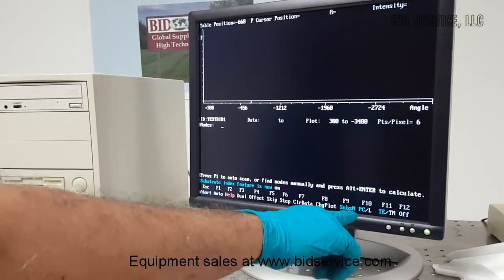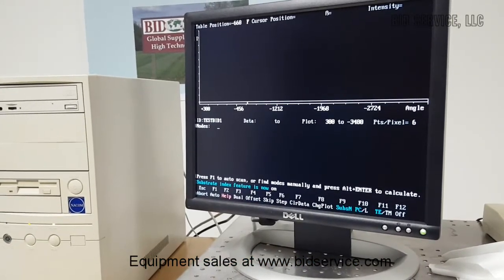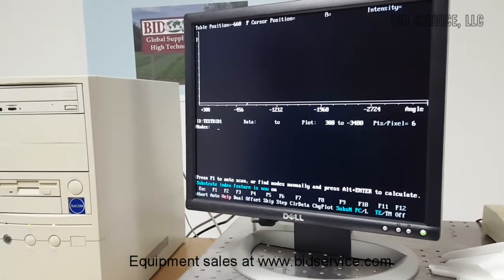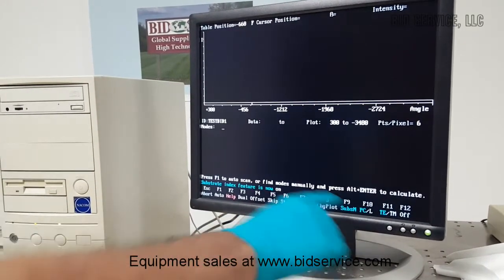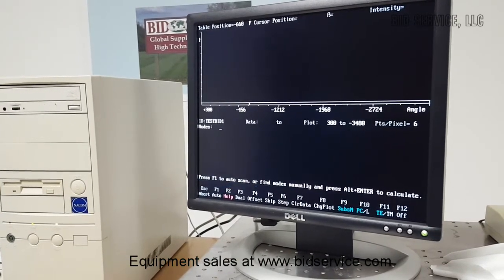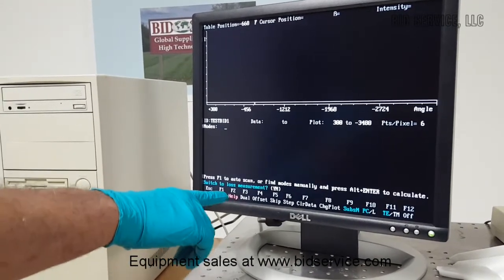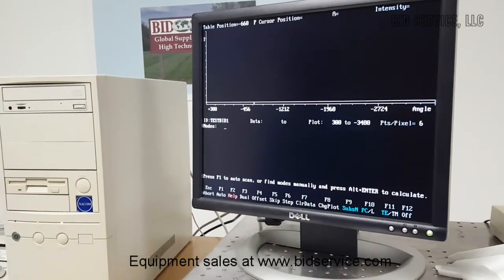F10 is for PC, which is for Prism Coupler film thickness measurements and the substrate index measurements, and L is for the waveguide loss measurements. By selecting F10 like this, we can switch between the modes. You press F10 and then switch to loss measurement. If you say yes, then it will switch to loss measurement. If you say no, it will stay back.